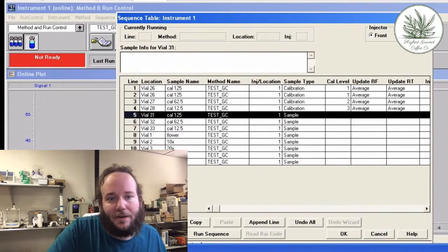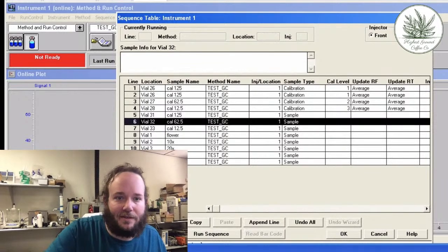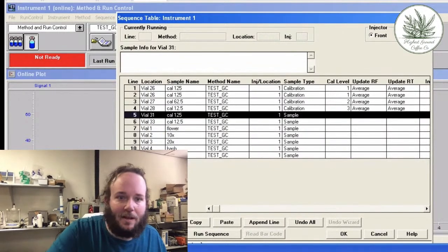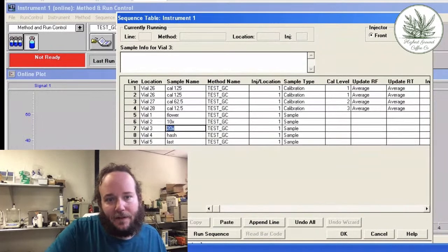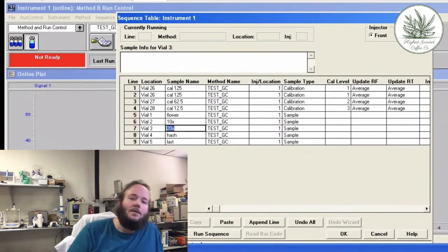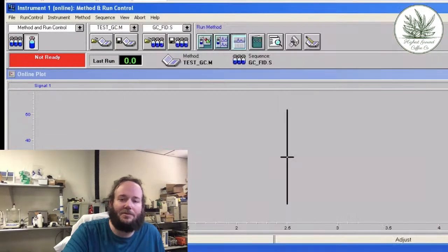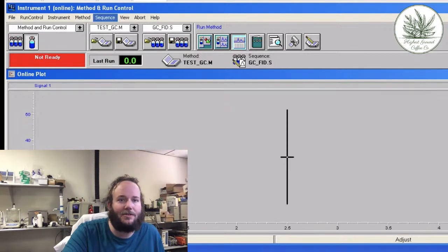But what I'm going to do here is take out these calibration runs because I don't really need them. Not for this. Just leave this in. And I'm going to rerun the entire sequence. Just let it run back to back. That way the calibration and samples can run in the same calibration window. It's what we like, you know. Make sure it's as accurate as possible.